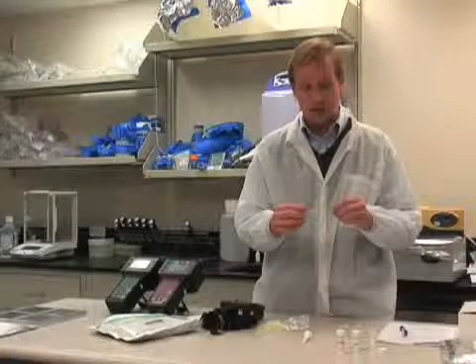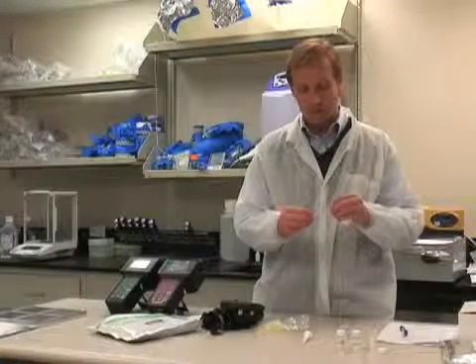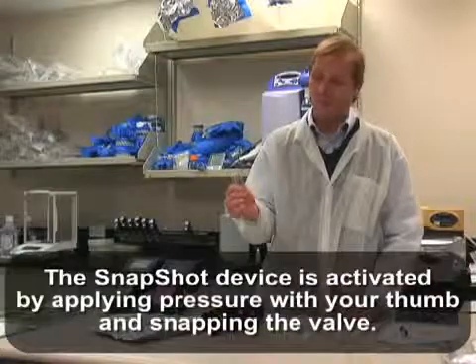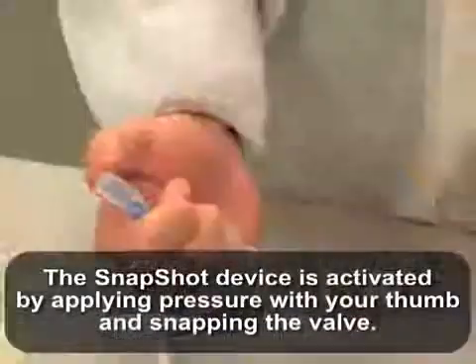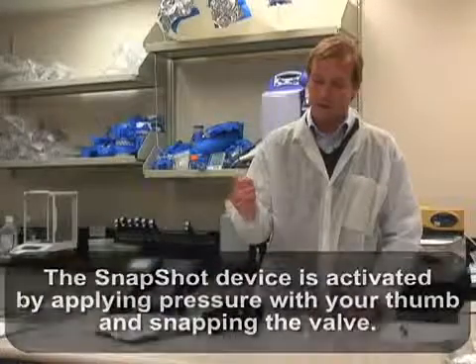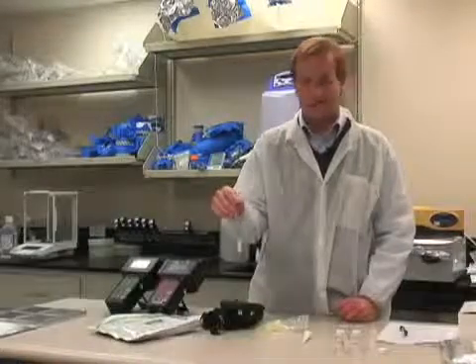put it back into the swab tube. And I'm going to activate the Snapshot by just applying a little pressure with my thumb to the snap valve, hearing it snap and squeezing it, and then shaking. Very simple.